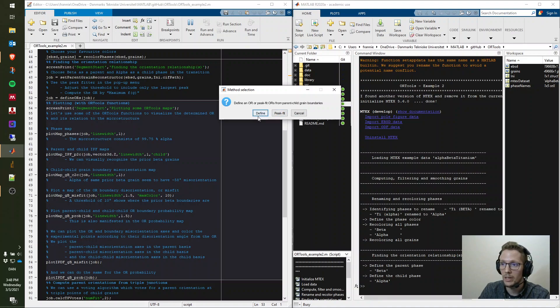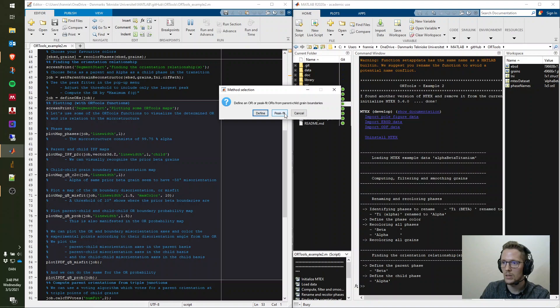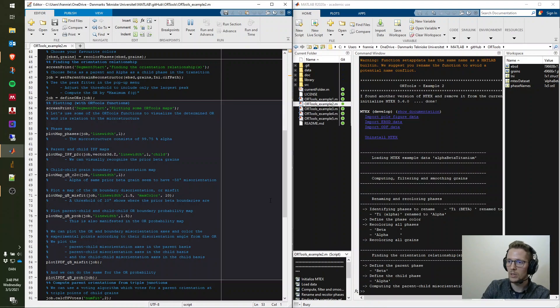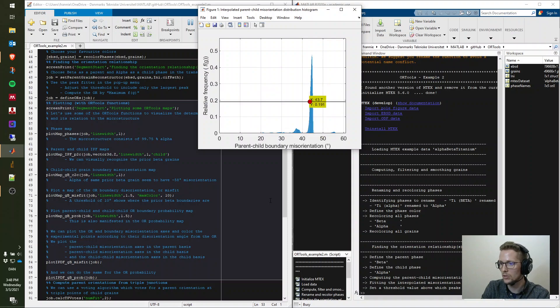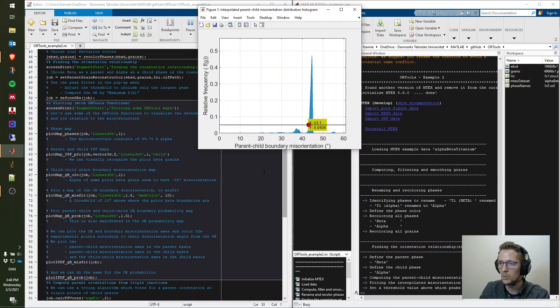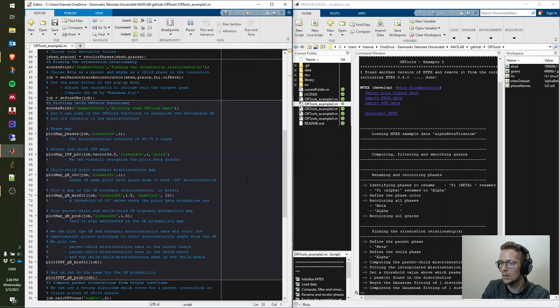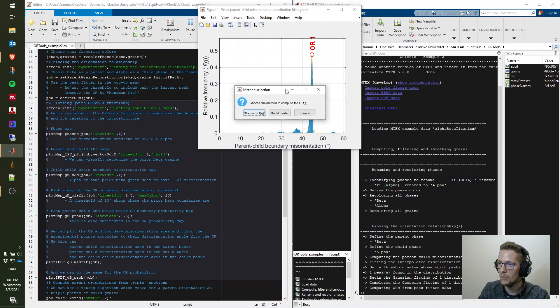We could use the graphical user interface to input parallel planes and directions to define the orientation relationship. Alternatively, since we have parent and child grain boundaries, we can use the peak fitting functionality. Using left and right keyboard keys, we set a threshold on the parent-child boundary misorientation distribution plot. There's a high peak corresponding to the orientation relationship, and a smaller one around 38 degrees to be explored later. We set the threshold to capture only the main peak.